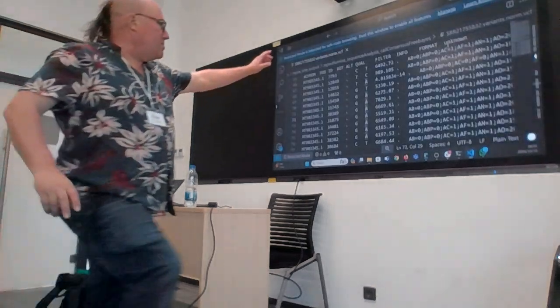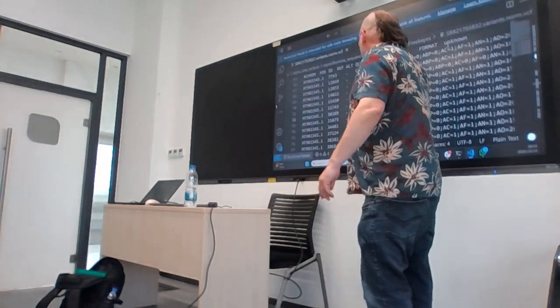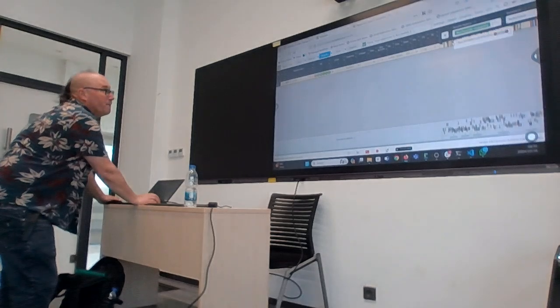So we see here 14022 G to T. Okay? Then when we look at our consensus, where is it gone? I'm sure that's this one here.